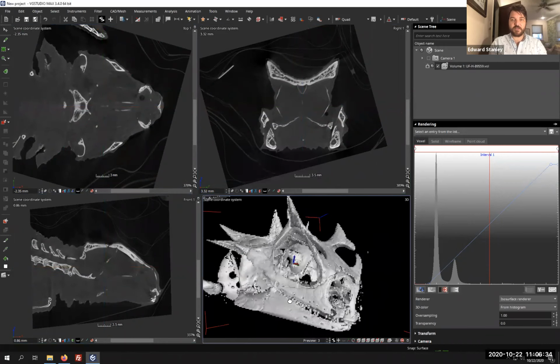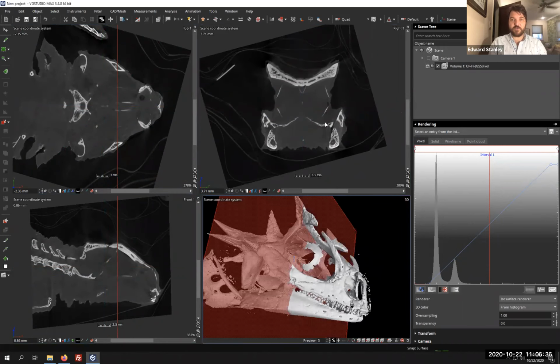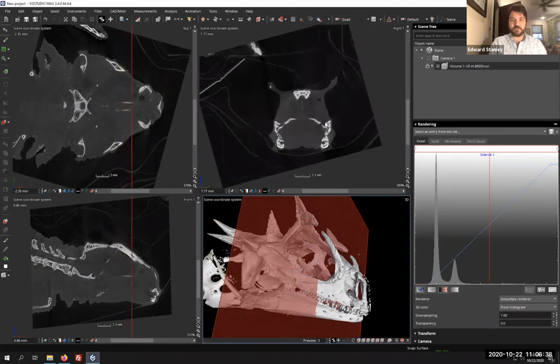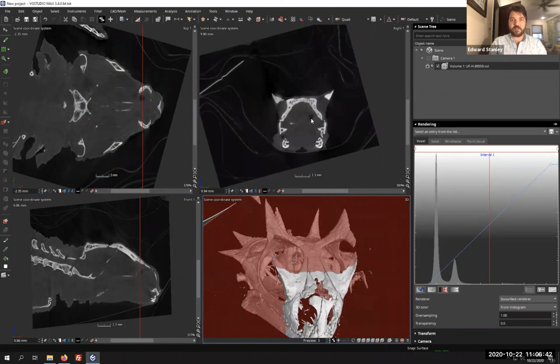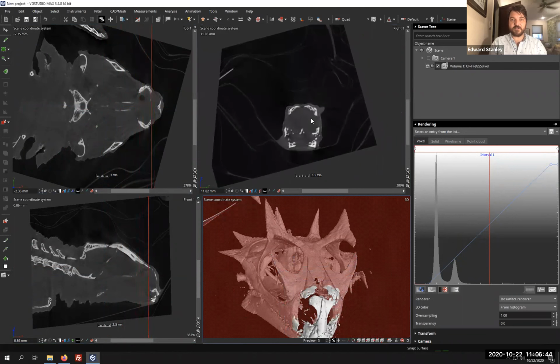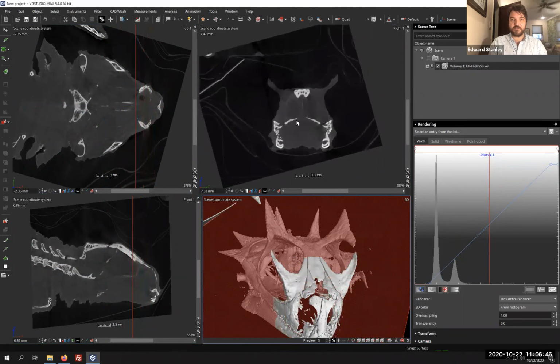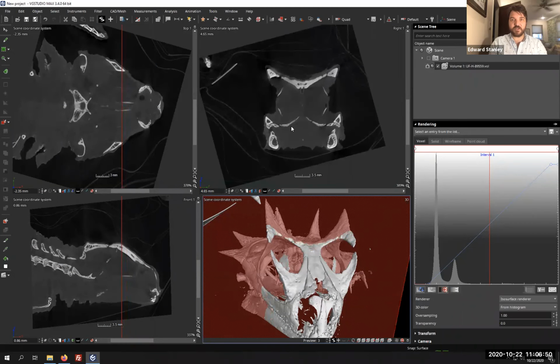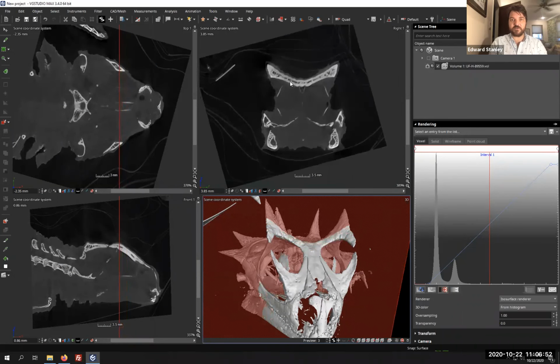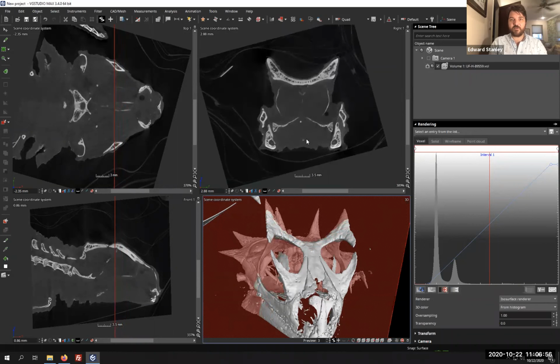we'll move this back. When we scroll through the slices, you'll see that now we're looking at a nice square on to the head here, and that makes it much easier to do the segmentation work, because most of the structures that you'll be looking for in this situation are probably symmetrical, and so you can check to see if the structures you're looking at occur on both sides.